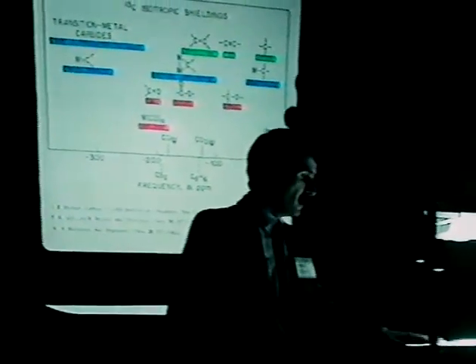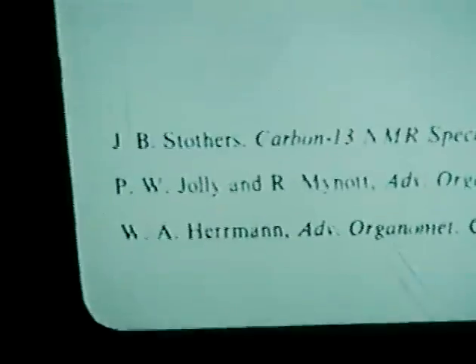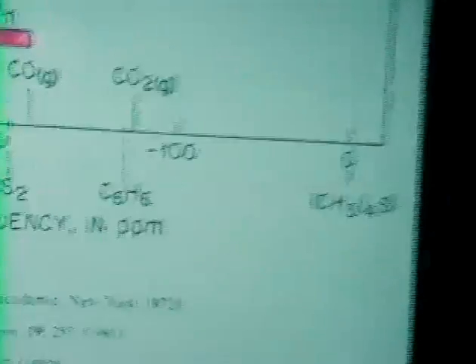As you recall, there are discrete bands in the carbon-13 NMR spectra corresponding to different types. First of all, I want to point out that we're going to be measuring the frequency shift of the line in parts per million. It's a fractional shift, so it's independent of what field you're working at, relative to some standard. For carbon-13, that standard is tetramethylsilane over here. I've applied it in the standard way, that upfield is in this direction, downfield is in this direction.